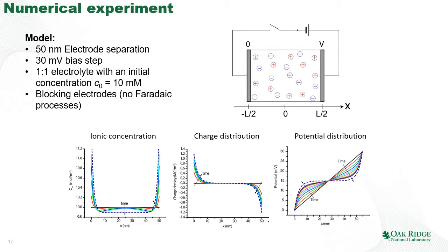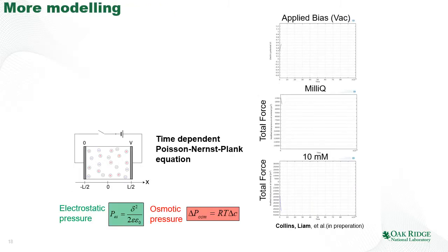So initially, potential is uniformly distributed, so we have a linear potential drop across the system. And with the charge redistribution, we start to see the electrode polarization. So our potential drops at the interfaces, but no longer drops in the central part of the sample. And notice that this dynamics is very similar to the one that we analyzed for the case of the time-resolved KPFM. And the reasons are exactly the same. Time-resolved KPFM is developed to study the surface ionic dynamic. Here, we look at the bulk ionic dynamic, but in both cases, system is quasi-one-dimensional.